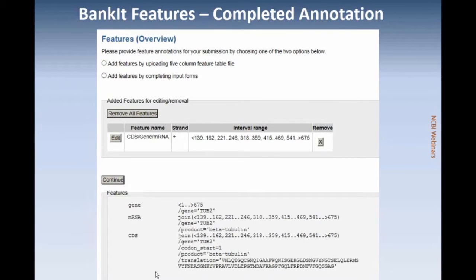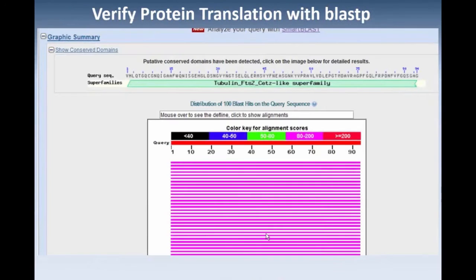In the BankIt submission tool, when you have your feature annotation correctly done, you will see this display for each sequence in your dataset. It's important that you consider doing a BLAST-P analysis. You can copy this translation and do a BLAST-P analysis. You get a lot of hits, and that's because we are doing the sequence determination of a commonly used molecular marker.